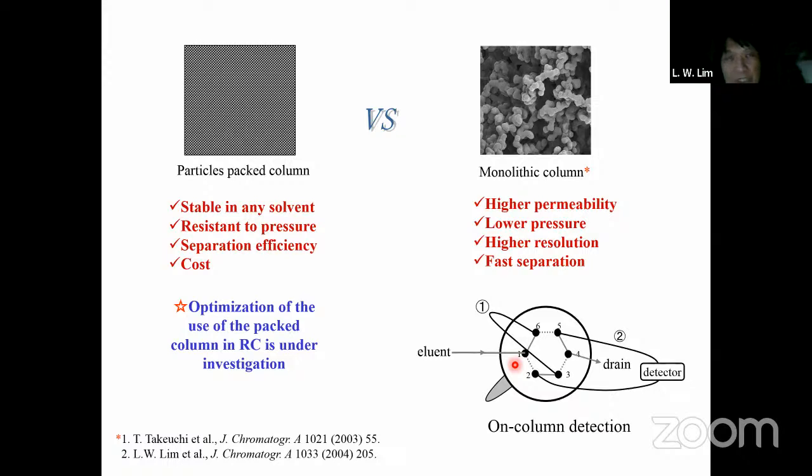So usually you have to purge your line. If you look at your pump, there is a setting called purge. Once you purge your pump, the pump will automatically use a very, very high flow rate to clean the bubbles in the pump. But just remember, before you purge, please make sure you have enough eluent in the container, because at the purge setting the flow rate is very high. If you don't have enough eluent, then when the eluent finishes, the pump will have more bubbles inside the system and it will become so bad.